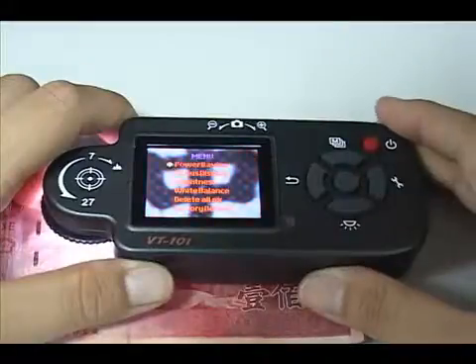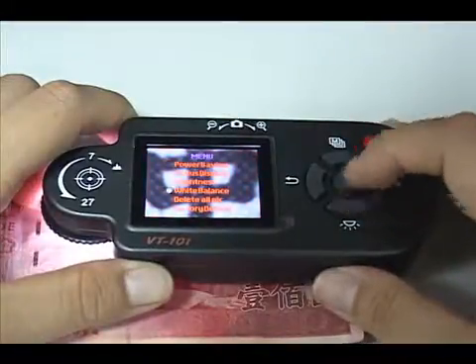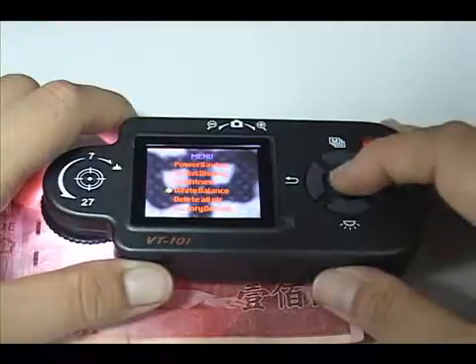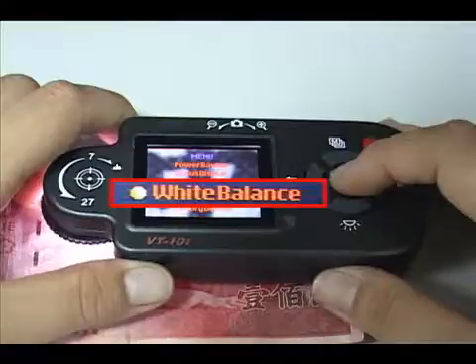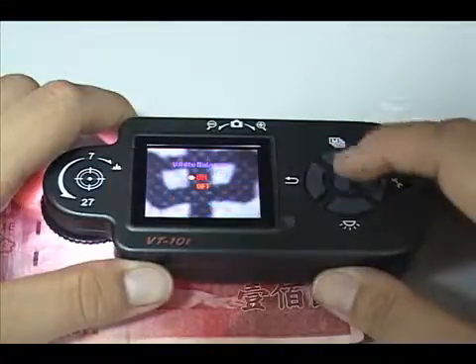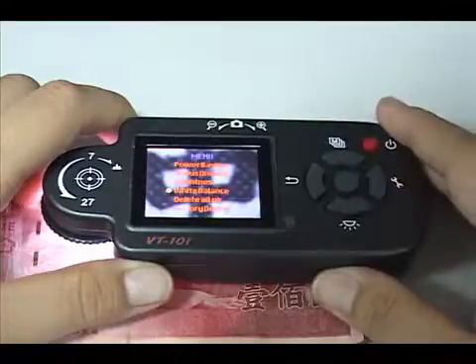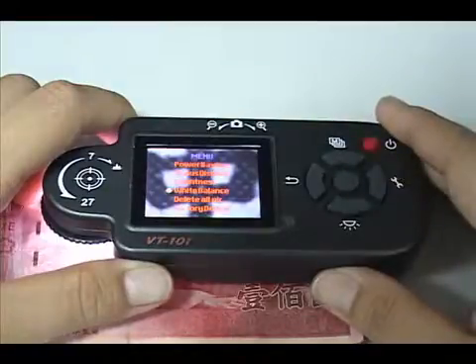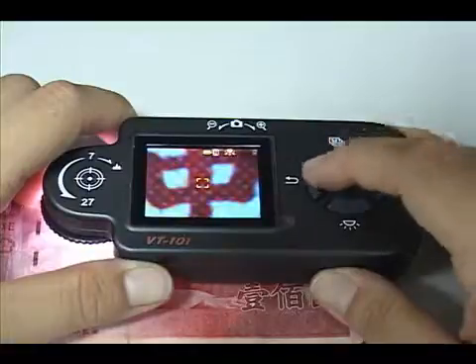There is a white balance function. When observing, it will automatically adjust brightness and contrast to improve image clarity. However, it may cause the true color to be lost. If you turn off the white balance function, you can see better, more accurate true color.